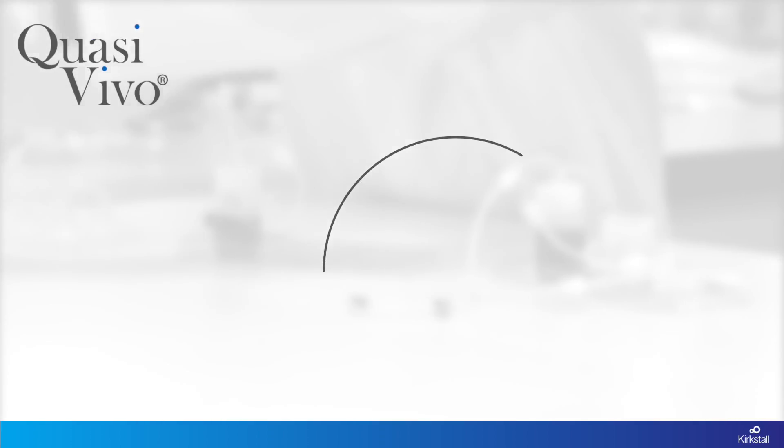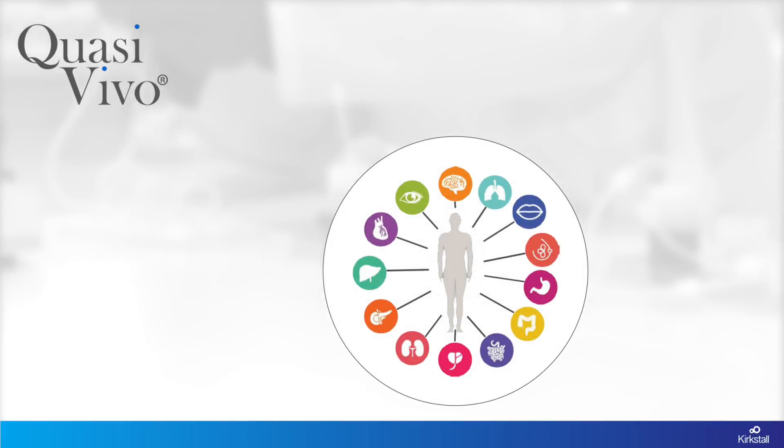The Quasivivo system has three different chambers available, designed to give you a wide variety of applications.